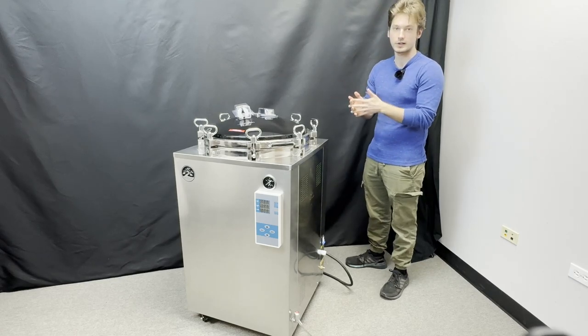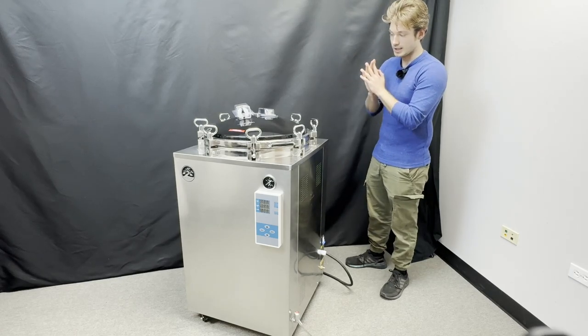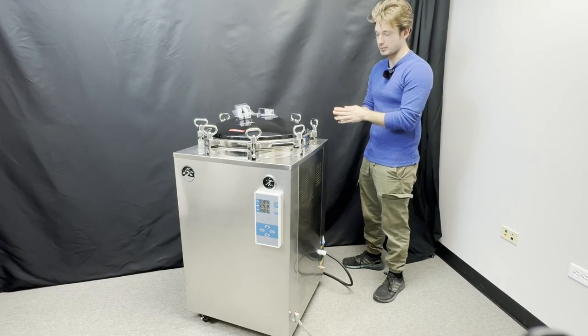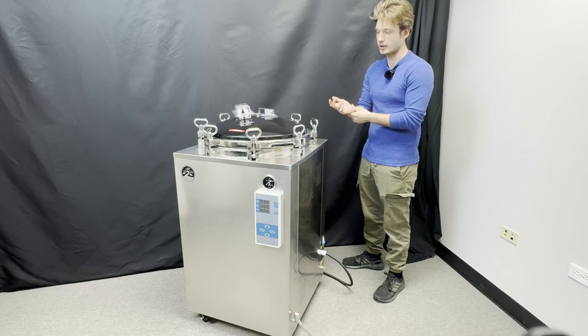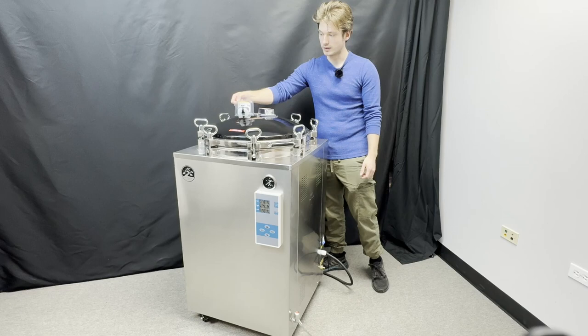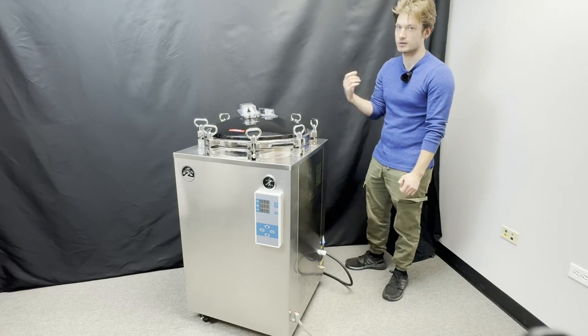Every 150-liter commercial autoclave comes standard with a 6-kilowatt electric heating element. It runs off a 240-volt power supply and should be connected to a 30-amp breaker. The whole system can be hardwired, however we do recommend installing it with a NEMA-style plug. If you need more details, go to our website or consult with your local electrician.